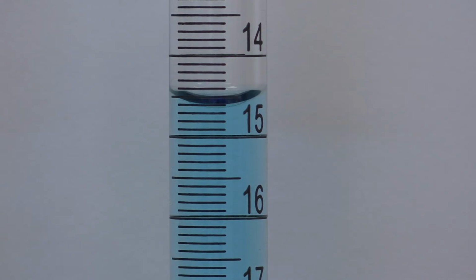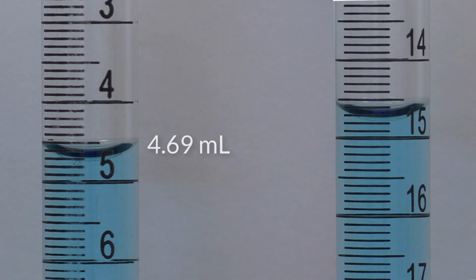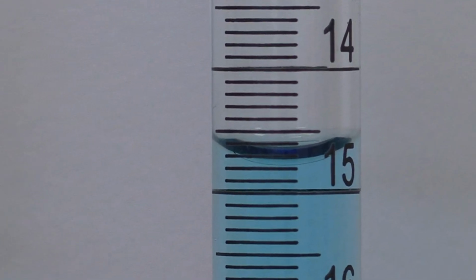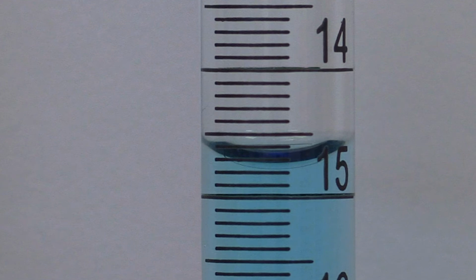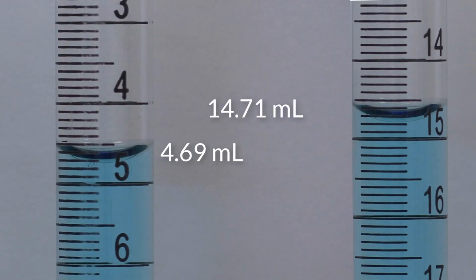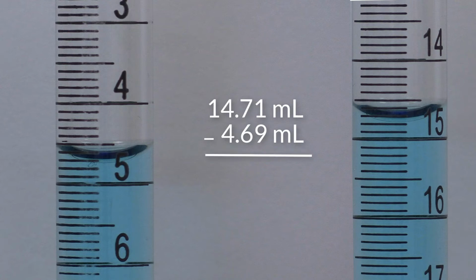We started the titration with a volume reading on the burette of 4.69 milliliters. When the titration is completed, the reading on the burette is 14.71 milliliters. To find the volume of the titrant added, in this case sodium hydroxide, we subtract the two values, which gives 10.02 milliliters. Now we have enough information to calculate the molarity of the acid solution.